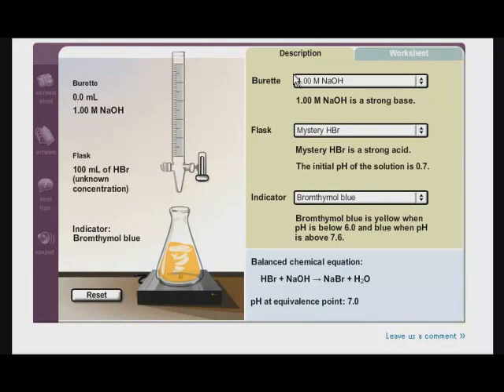So to start with the titration, right now we have a solution that's yellow, and it tells us over here that we will reach the endpoint when this solution turns blue. So to begin adding the substance that's in the burette, we are going to begin letting it flow, and you can let it go fairly fast in the beginning.